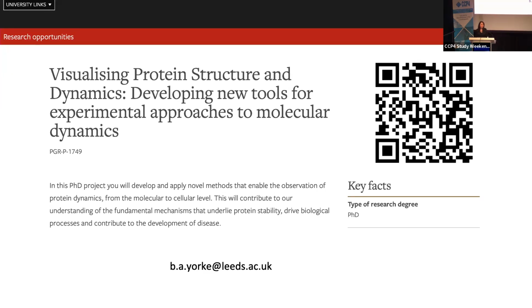Did you only calculate the standard 2FOFC and FOFC maps, or did you try other approaches as well, such as FOFO maps and so on? No, at the moment I've just done the FOFO, but I'm definitely going to try doing some extrapolation, because it might be that there is a small signal which you can extract with those kinds of maps. Yeah, I'm desperate to go home and start trying that now.